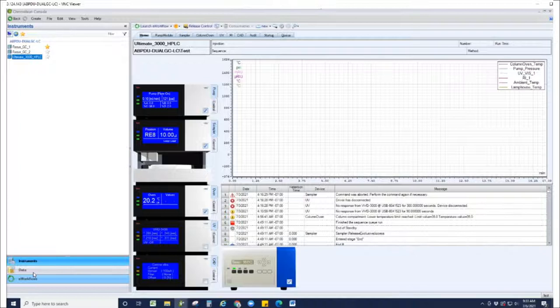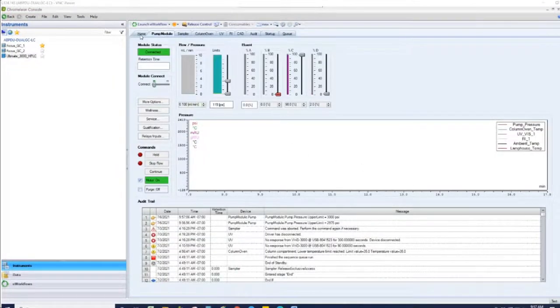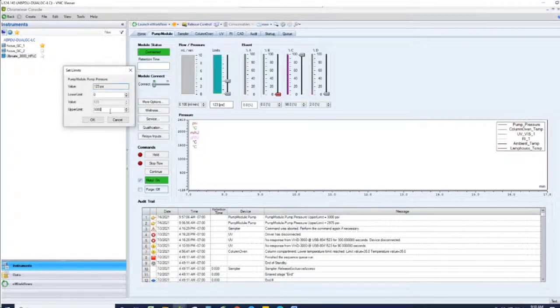In the instruments section, select Ultimate 3000 HPLC. Across the top bar, you will see the options Home, Pump Module, Sampler, Column Oven, UV, RI, CAD, Audit, Startup, and Q. Under Pump Module, you should see that the module is green and says Connected. If the pump module is not connected, ensure the pump system is turned on and select Module Connect in the Pump Module tab. After connecting, you will have the options to edit the pump flow rate and set pressure limits.